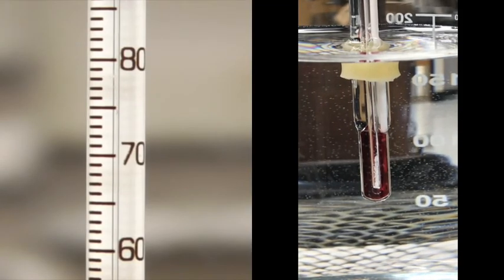Okay, we're back with our second trial. Since that water was hot enough to melt the sample, the biphenyl, what I did was dump about half of that hot water out and added cold water. So now the temperature of our water is about 47 degrees. I'm going to heat that up to about 65, and then slow down the heating.